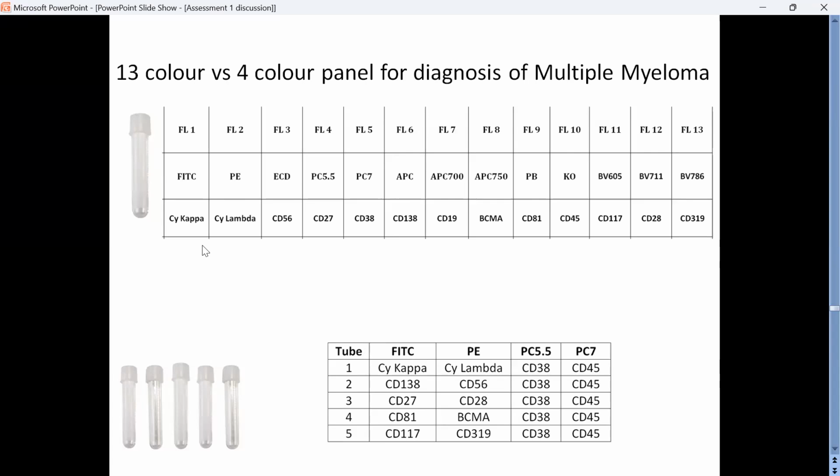See, this is fine. You may think, okay, 500, what's the problem? 2 ml of sample is there, so I can use 500 microliter. This 100 microliter is when the sample is hypocellular. Okay, 100 microliter may not be sufficient. Then I need to add 500 microliter here to get that desired number of cells. If it is 500 microliter in each of these tubes, 2.5 ml of blood will be needed, which may not be there in the marrow aspirate tube sent to you. So here you have a problem.